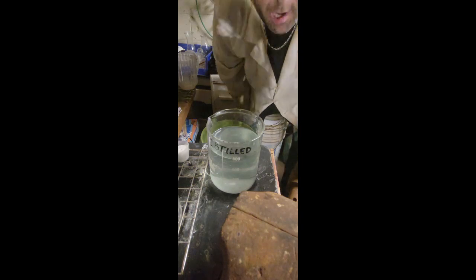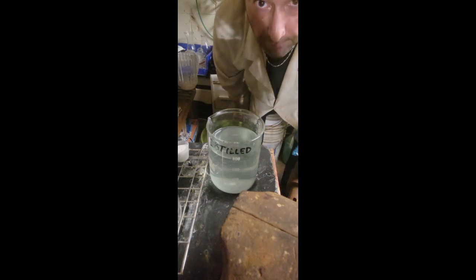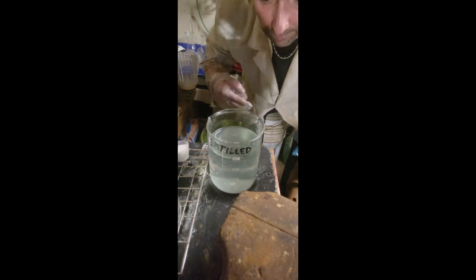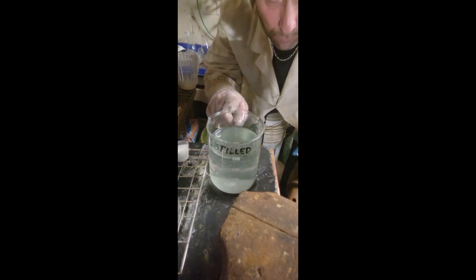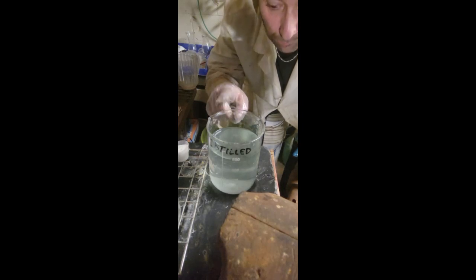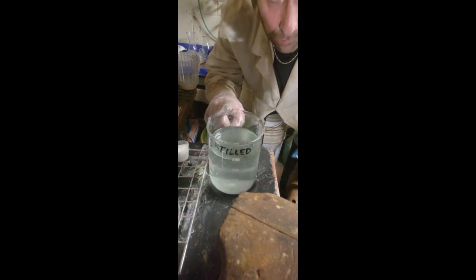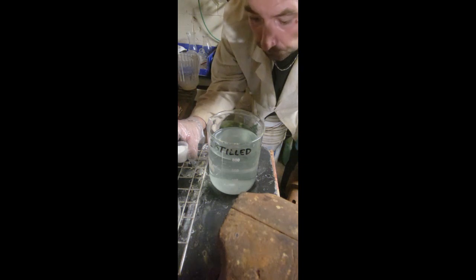If you're wondering why my water is a little discolored, it's because I'm actually recycling water from my previous reactions. I'm going to show you how you can save water. Do not dump it. It does contain silver in it and you can reuse it. This channel is also about reusing items and not flushing things away that we don't have to. We reuse it, we concentrate it, then we process it. All right, now for the chemical we've all been waiting for. You ready?